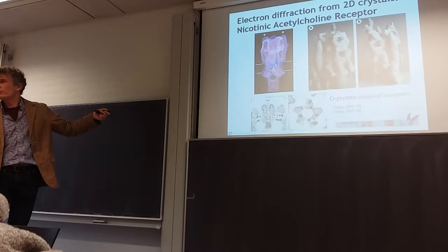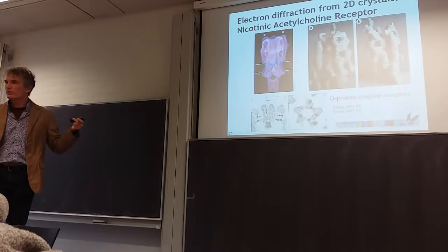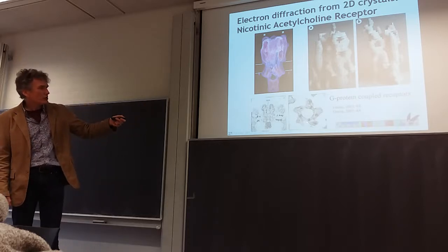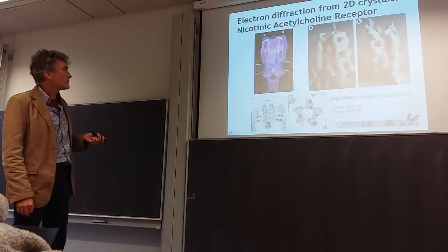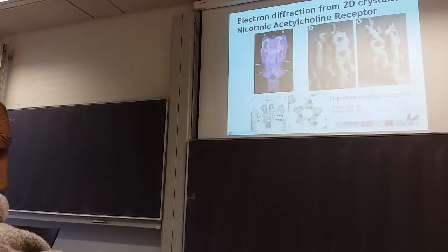Is that too small from the back? You can see it. And this is when you look from the top, so you see the black bits of high density at the center of the helices, and then you see the channel in the middle. So lots of useful information, but it's also quite limited.